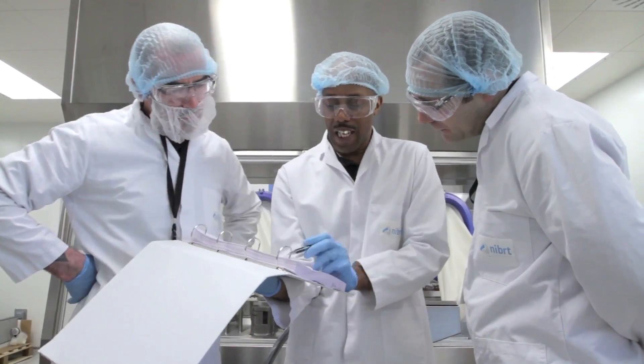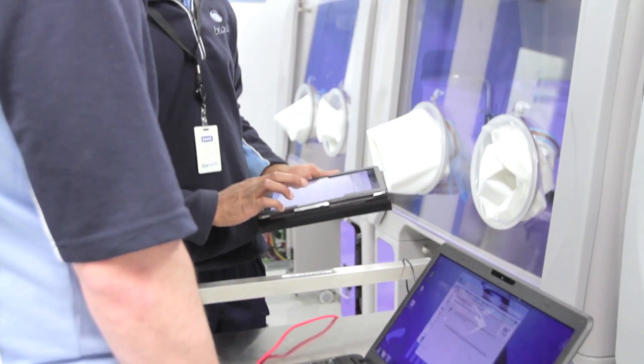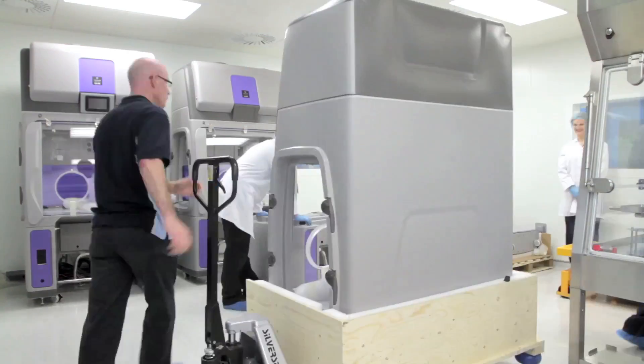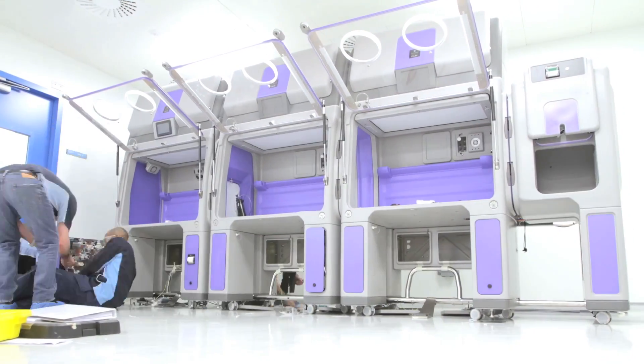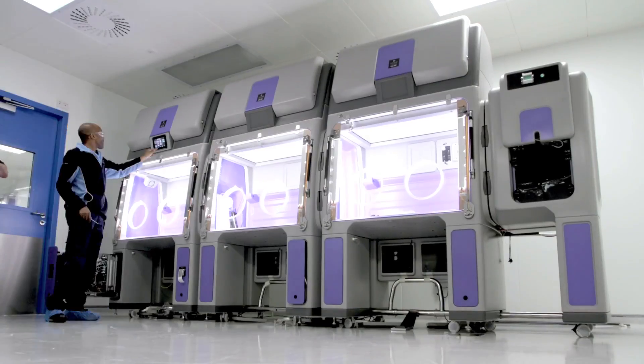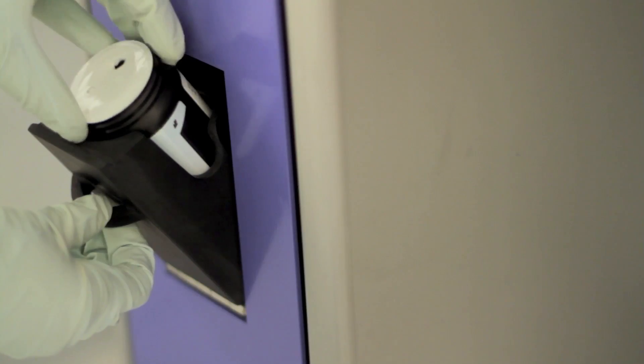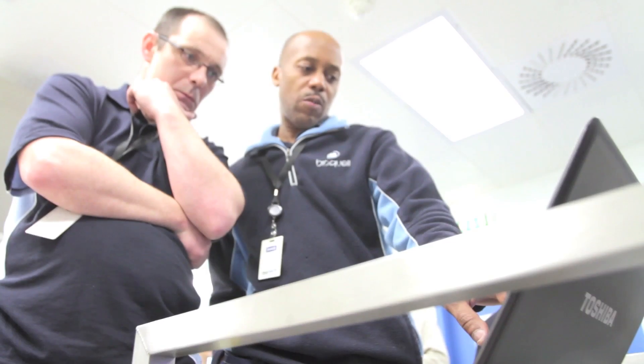Additionally, the Cube can be fully operational including IQ-OQ testing in under 5 days. What makes the Cube unique is that it features an integrated gassing system so it can become aseptically clean in just 90 minutes.